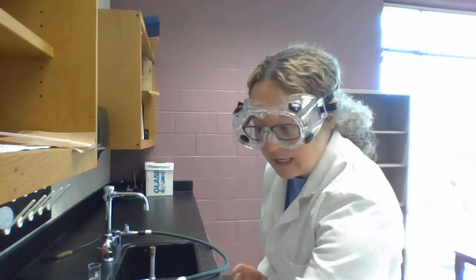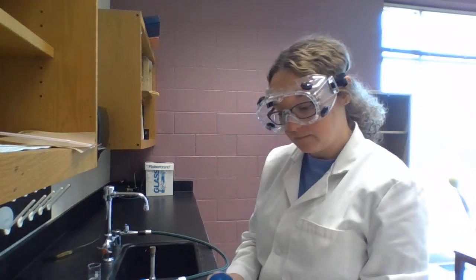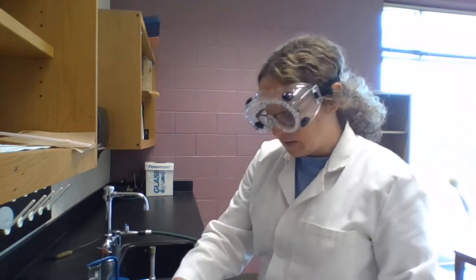Okay, so next step, it asks us to add a couple of drops of water to our magnesium oxide. So I'm adding some water to my magnesium oxide. Now, a metal oxide plus water produces what? This type of synthesis is going to produce a base.